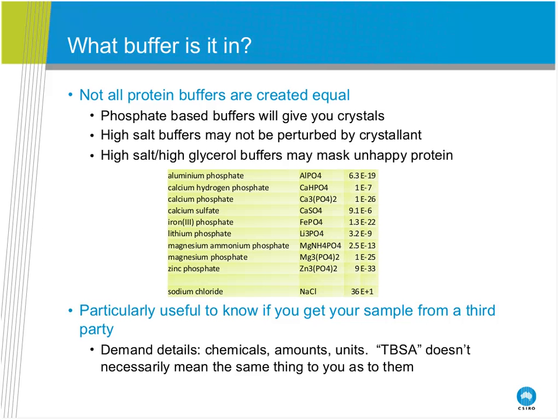The other thing to remember is that you can make your protein in high salt buffers, and that's great, except that means that your protein crystallization experiment will tend not to perturb that system as much as it would if your protein were in a more minimal buffer. So that's also something to remember. And a further thing there is if your protein only stays in solution in 10% glycerol and 500 millimolar sodium chloride, you don't have soluble protein.